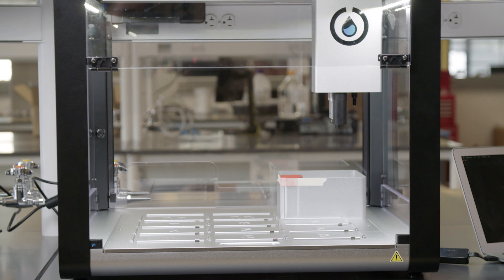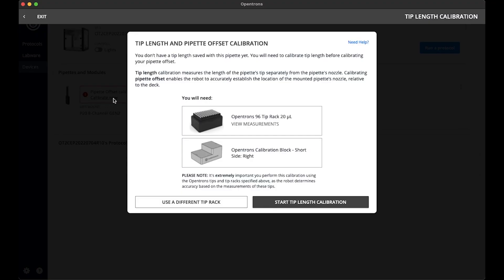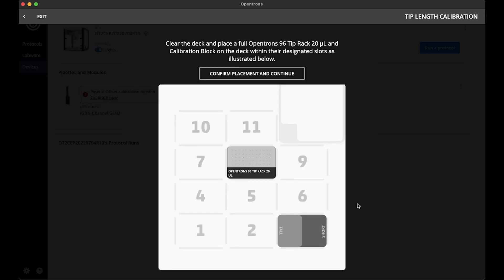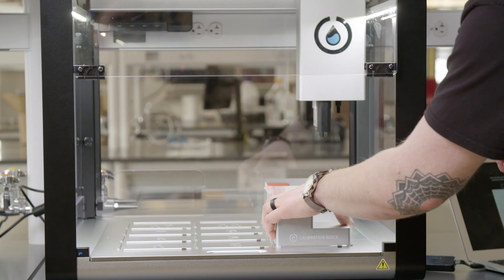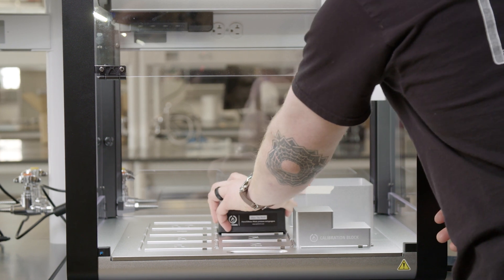The OT2 will now home and prepare itself for the calibration. I will need a tip rack, preferably Opentrons, and a calibration block for this calibration. I have both, so let's start tip length calibration. The Opentrons app will walk me through the instructions. I need to set the two pieces of labware — the calibration block and the tip rack — on the deck as shown in the app.